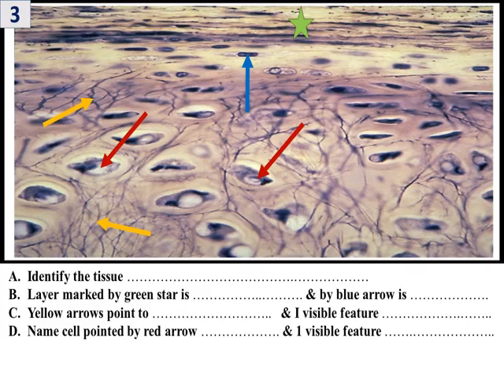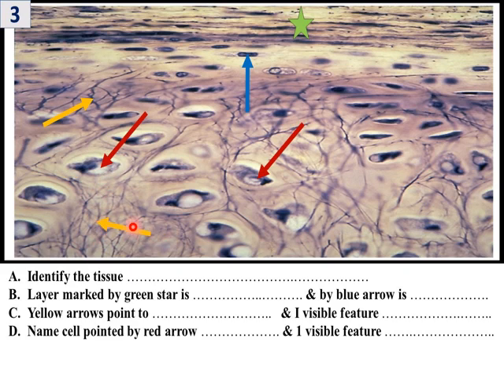This is yellow elastic cartilage. How do you know? By the presence of elastic fibers. Here is the perichondrium with outer fibrous and inner chondrogenic layers, the chondrocytes, and these are the elastic fibers — that is how you identify yellow elastic cartilage.